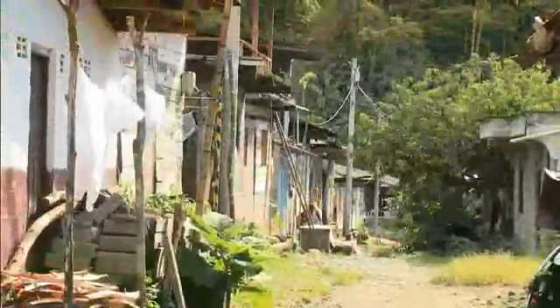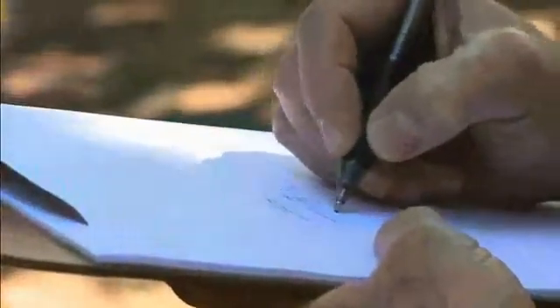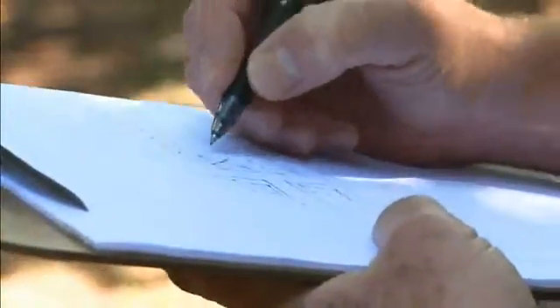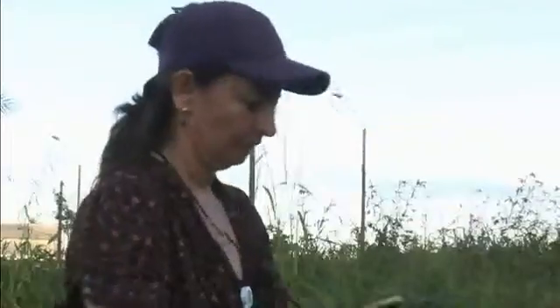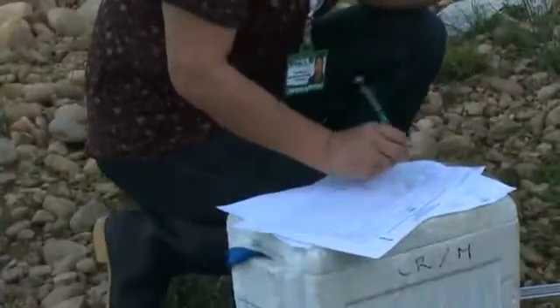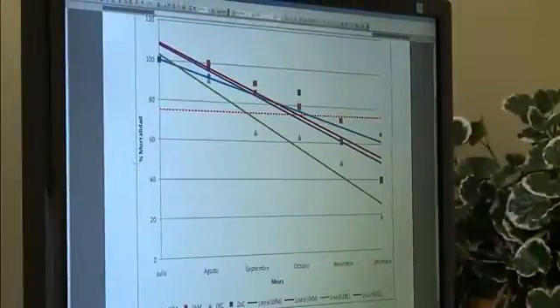Since periodic sampling might be necessary to monitor the efficacy of residual spraying, draw a sketch map showing the location of households sampled. If a GPS unit is available, take the geographic coordinates from where you collected your sample, remembering to record the latitude and longitude in decimal degrees. The results obtained should be shared with the Ministry of Health or the National Vector Control Program for use in decision-making.